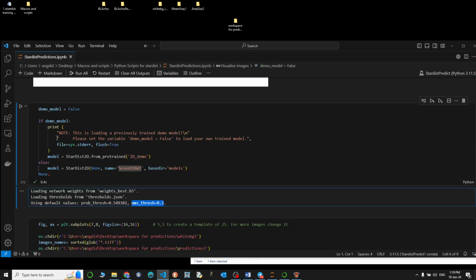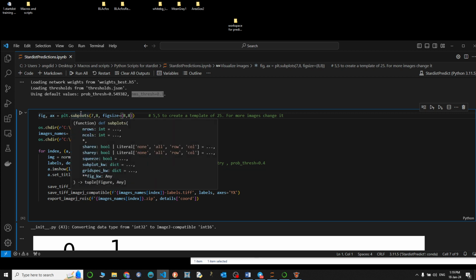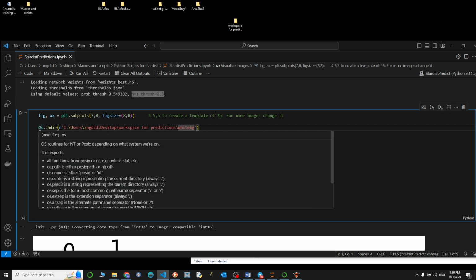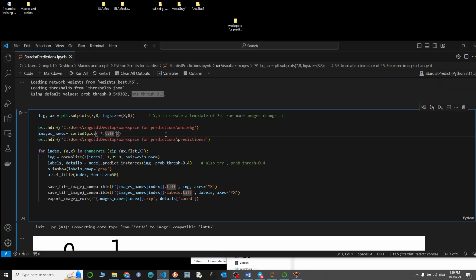Okay, moving forward now, the network is already loaded, so now we just have to run it. Again, I'm superstitious and not very aware of how things really work computationally here, so I just reduce the figure size to 8 and 8. What I want to do next is locate the path of the directory that has the images inside, all right? And it's this one. So if you see that path, it's practically this path. So that's good. And keep an eye on that if again here.